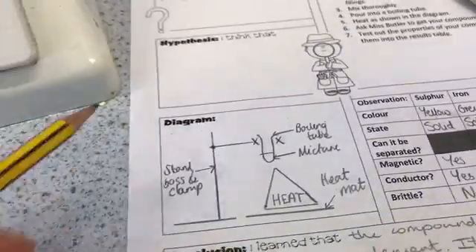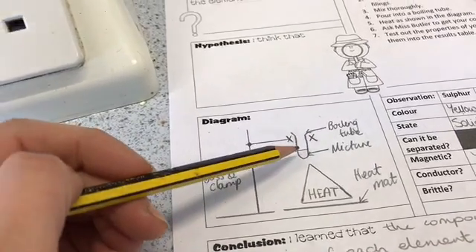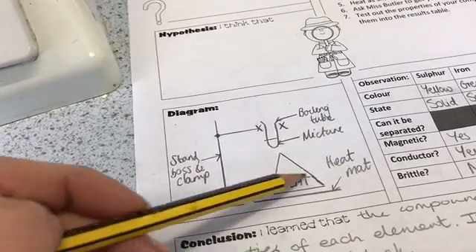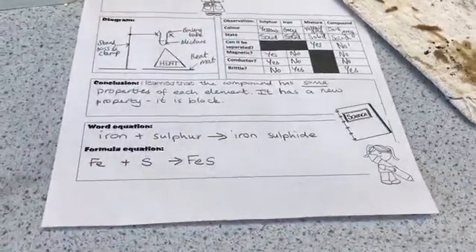Label the stand, boss, and clamp. Then label the boiling tube with the mixture in — obviously it's not a mixture by the end, it's a compound. Then label the heat mat. You don't label the Bunsen burner separately because it has a heat label on it, which is all that you need. And that is a completed diagram.